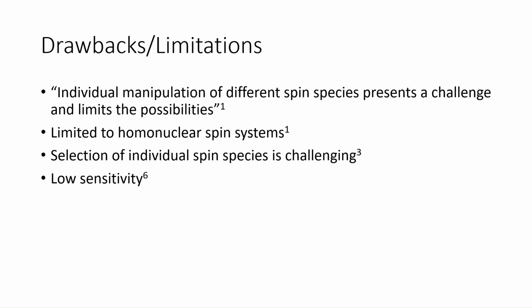Resonance frequencies are not as well separated in zero-field NMR, and the selection of individual spin species is not as straightforward and presents a challenge while limiting its applications. Though there are some quantum control methods that have been and are being developed to overcome this and other difficulties.